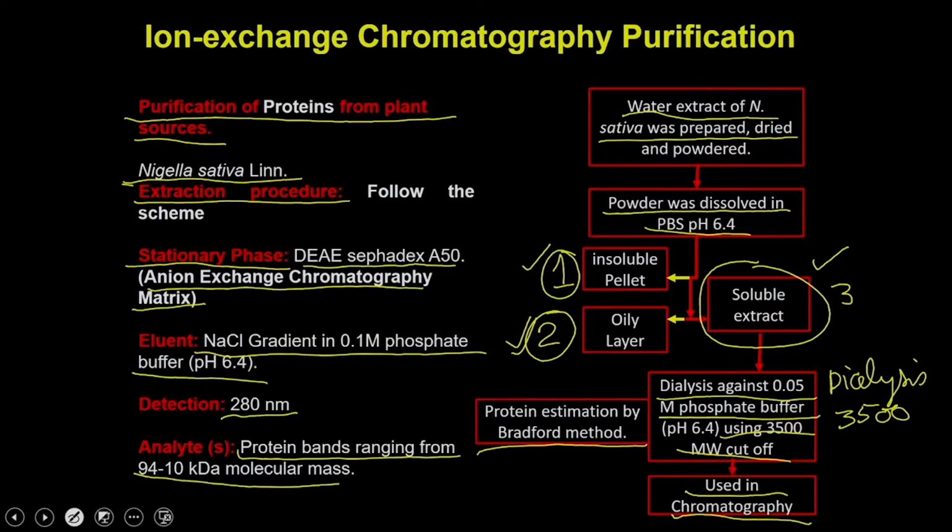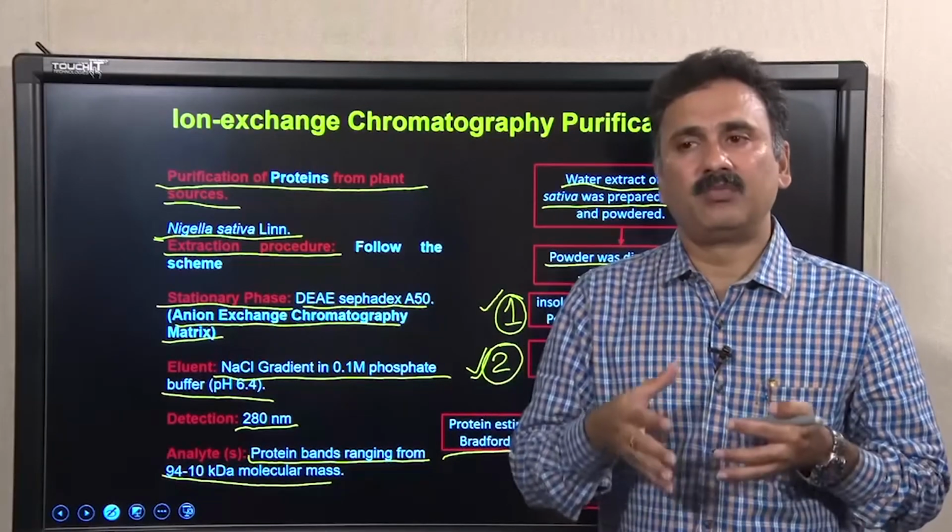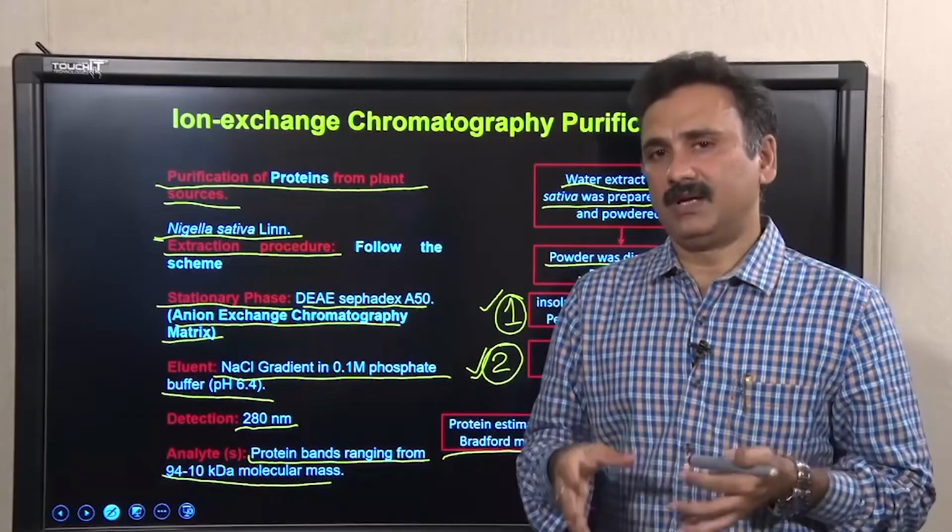and that will give you the protein bands of the different molecular weights. Now, depending on your choice or your protein of interest, you can refine and fine tune this protocol, and you can get the desirable proteins in very high quantities.